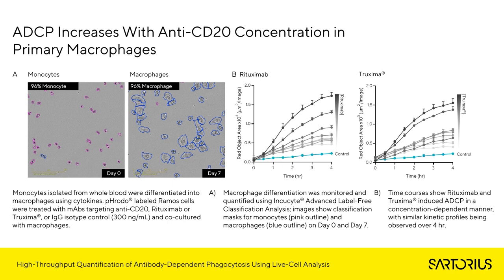Looking at the time course kinetic data, this shows that rituximab and truximab induced ADCP in a concentration-dependent manner, with similar kinetic profiles being observed over the 4-hour time period.